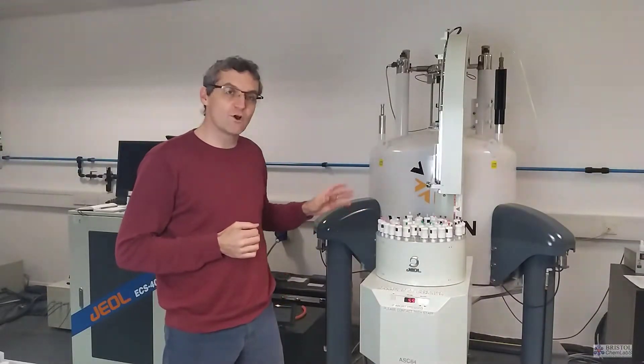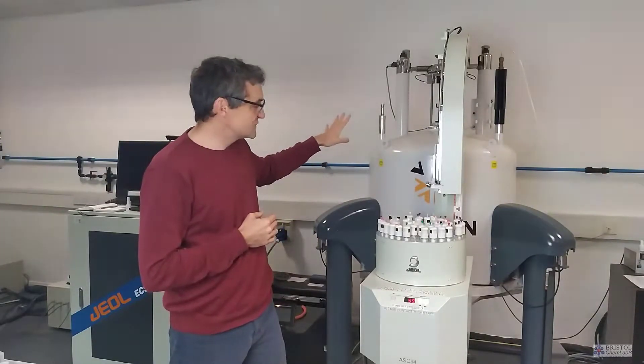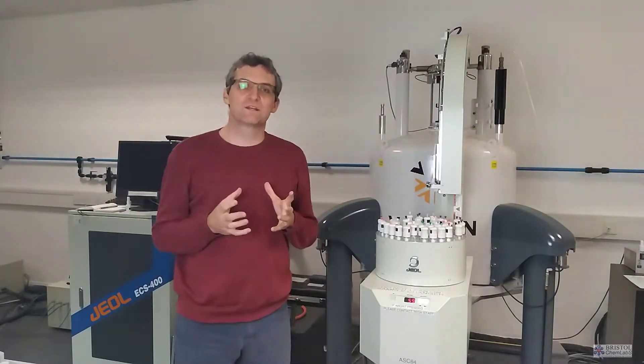When the sample's loaded onto the robot, it gets loaded into the NMR spectrometer and then this big can here is a magnet. It's a very large and strong superconducting magnet. A superconducting magnet is one which is permanently at field. It permanently has a very strong magnetic field.